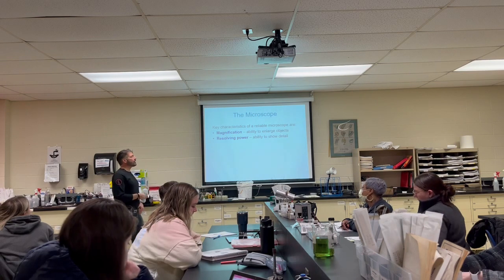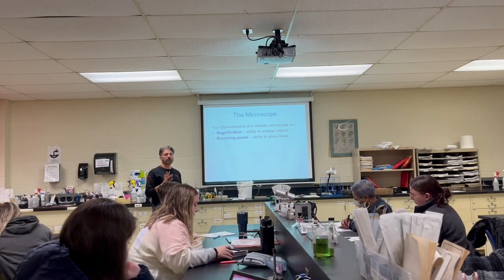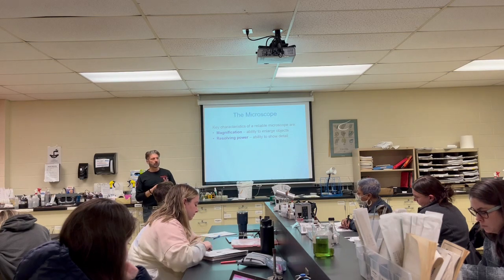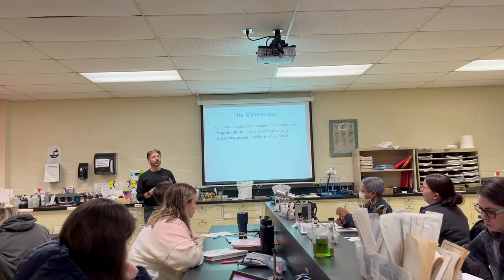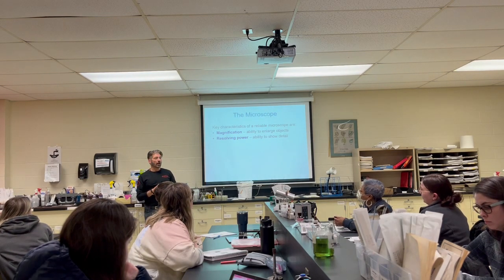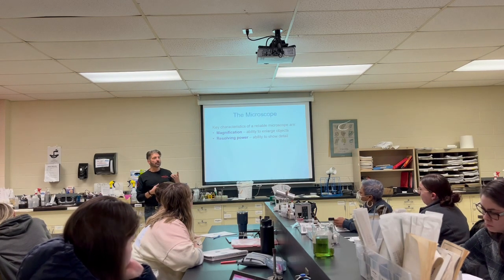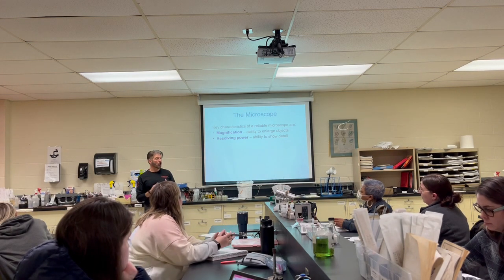All right, so magnification is the ability to enlarge objects. Anyone who's taken anatomy before, what's the most magnification we get on a microscope? Or how would you figure it out? If I ask you in the future, how do you figure out what total magnification you have? Multiply it: eyepiece ocular times the objective. So all the eyepieces here are 10x. The largest magnification we have here is oil immersion, which is 100.